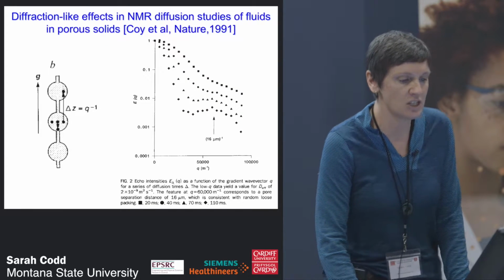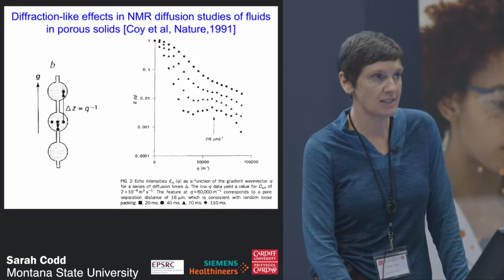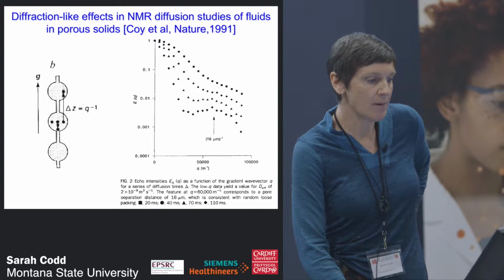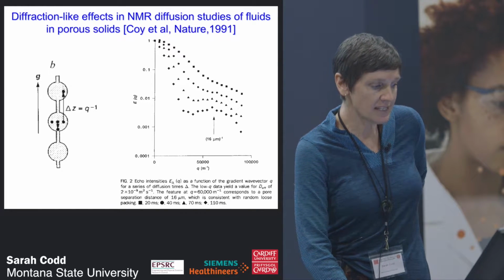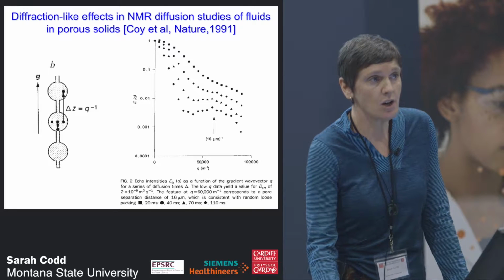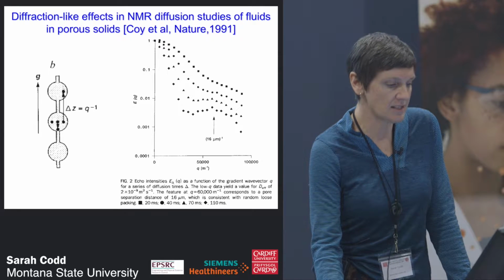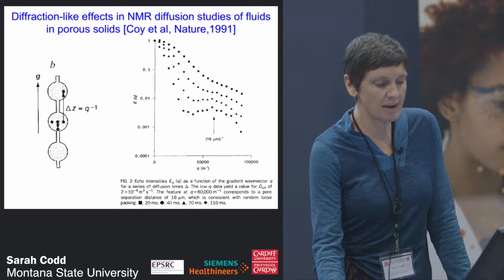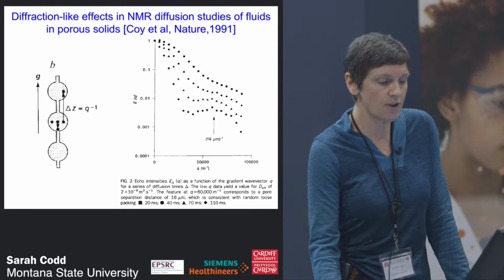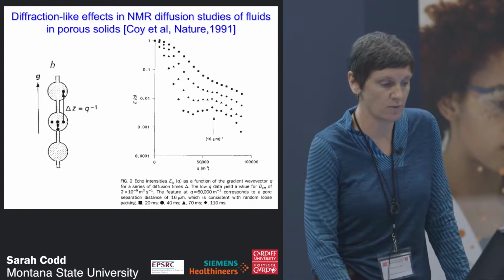So after I finished my PhD, I went over to New Zealand to do a postdoc, and this was my first introduction to the idea of Q-space, through some work that Andrew Coy, who was in Paul Callaghan's lab, had done, defining this idea of Q-space and the fact that we can look at the structure of porous media by looking at how the molecules move around inside that porous media. This was his data, taking the Q-space domain of water diffusing amongst small polystyrene beads and the diffraction peak that occurred at the exact point you would expect based on the structure of the porous media.